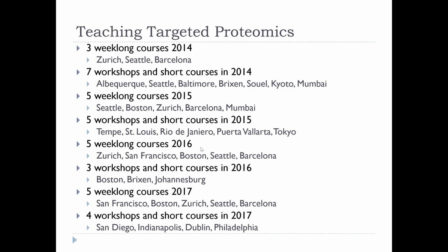In fact, when I started, it was SRM, it was targeted proteomics, and I looked around and I went, wow, there's maybe 10, 20 labs actually doing this right now. And so we had a very small market, and in order to grow the number of people that could use this stuff, we had to teach it.